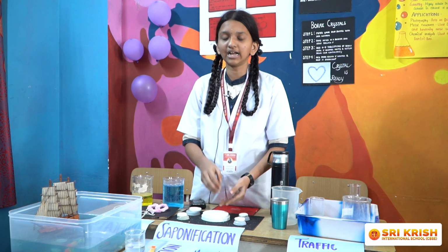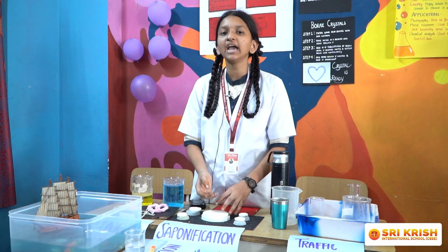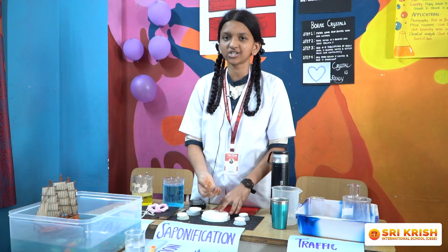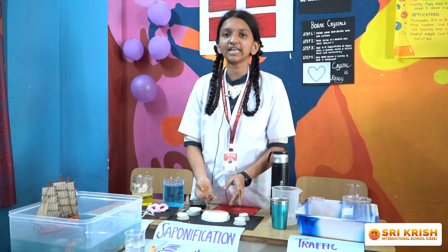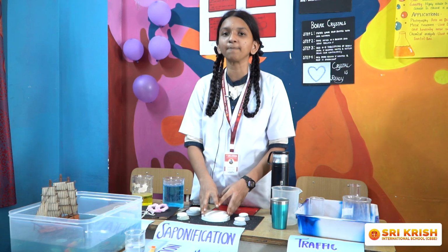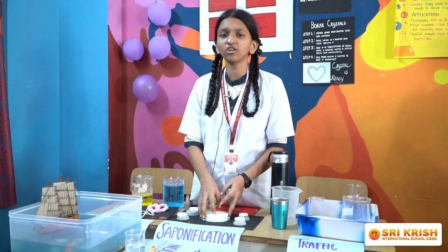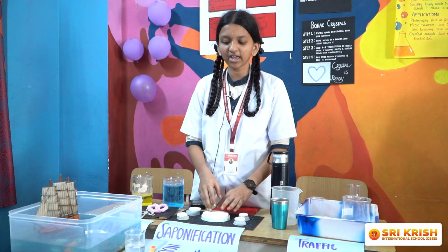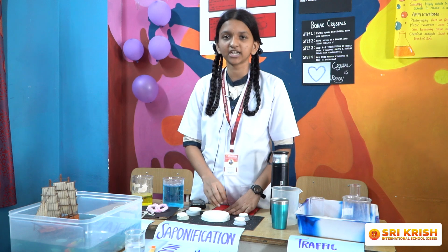Coconut oil helps in the hardness of the soap, and it also contributes to lather formation and moisturizing the skin. And we use NaCl solution here because NaCl solution will remove the irritation and itching from the skin. That is why we are using all these materials in the preparation of soap.